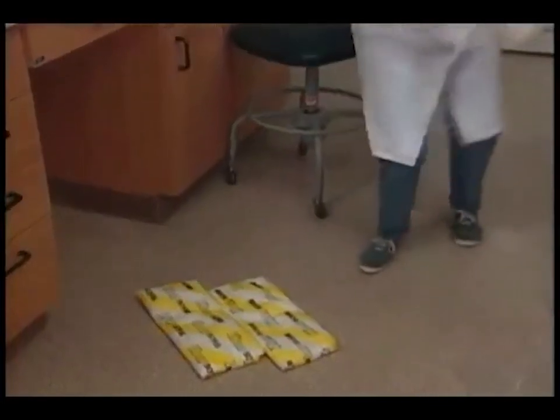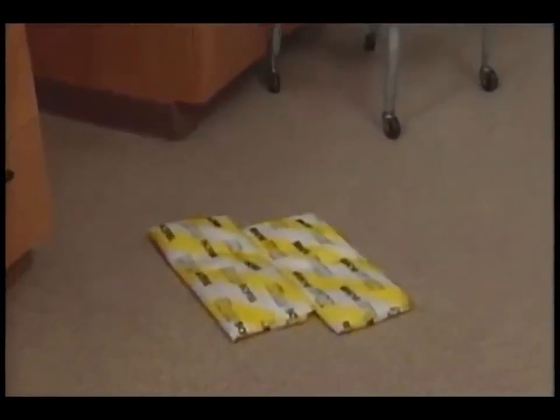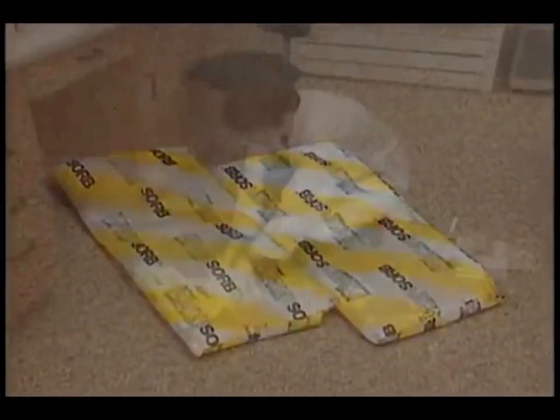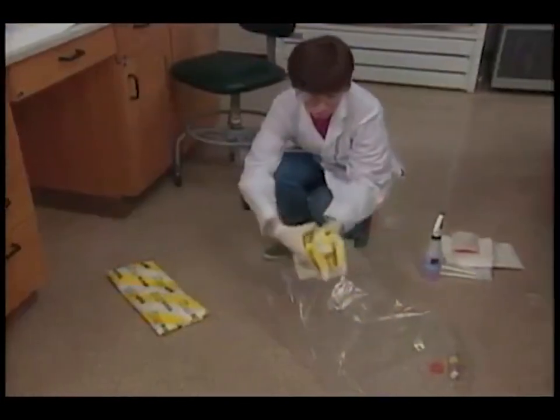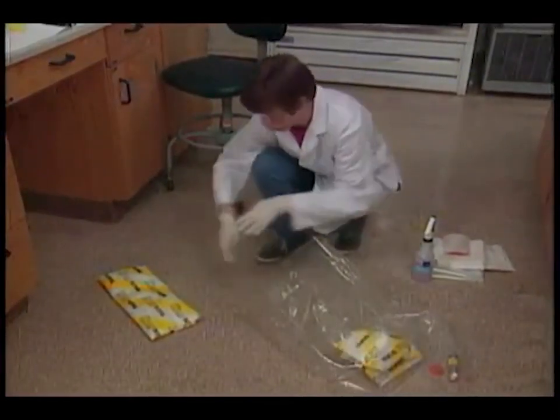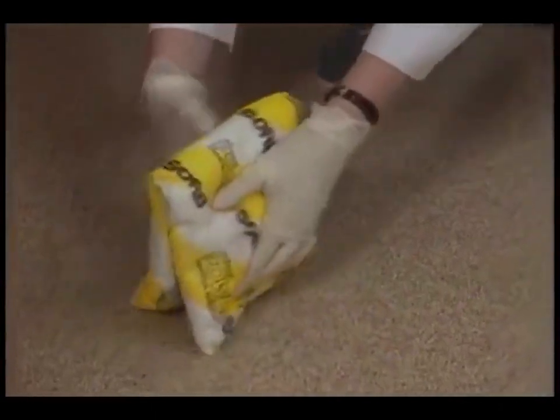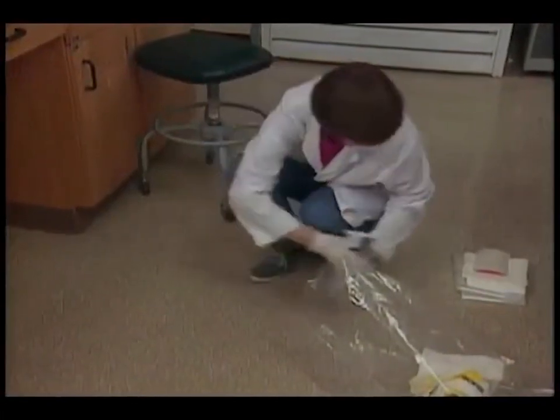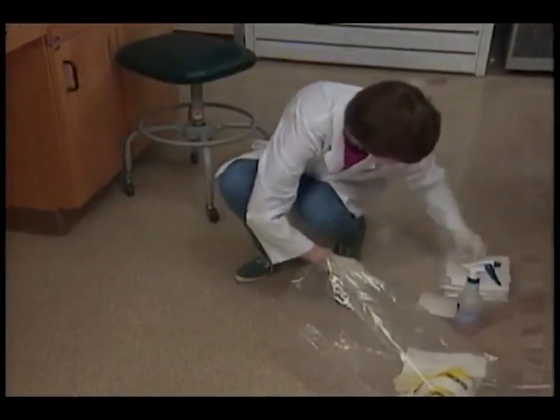Gretchen uses absorbent pads to soak up the phenol. Repeated washing with detergent solution will assure complete removal.